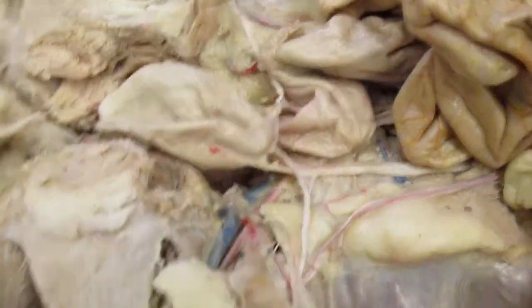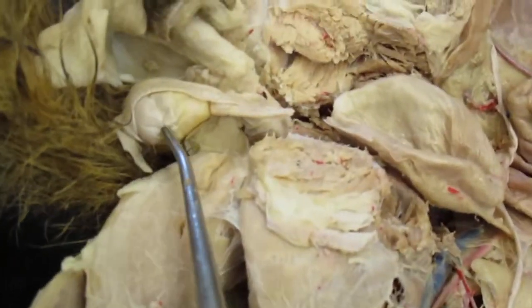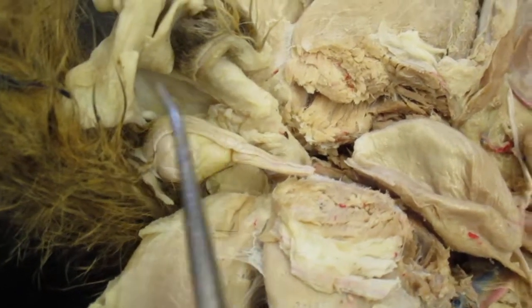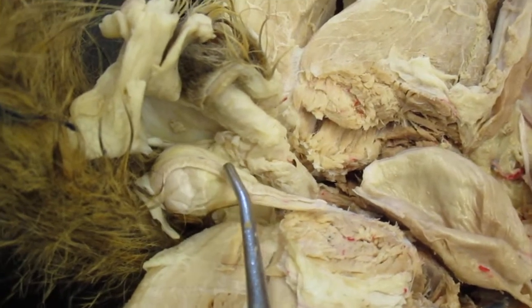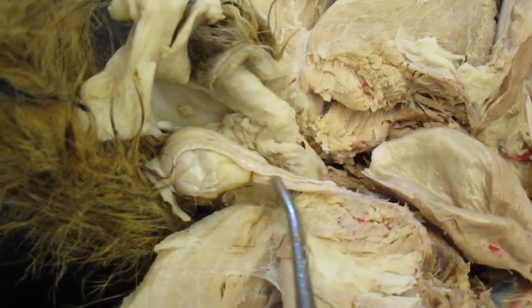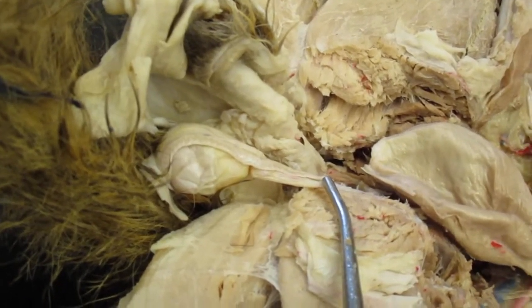Broad ligament. Okay? Now for the male, we can see the testis right here. This structure right here is your epididymis. And this structure right here is your spermatic cord, which I accidentally cut.